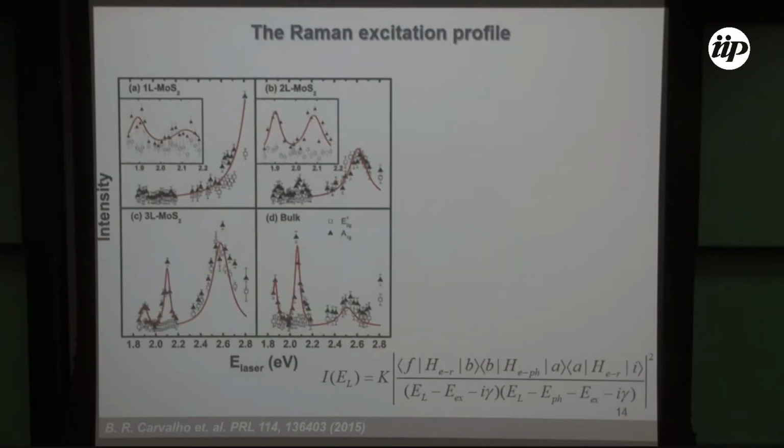So basically, what I'm seeing is how these phonon modes are coupling with the electronic transition of the material, the exciton. So I would say this case is the exciton-phonon coupling that I'm analyzing. I can see quite well for bulk, for instance, here is the A peak position: the A exciton energy matched with this peak. This one as well with the B exciton.